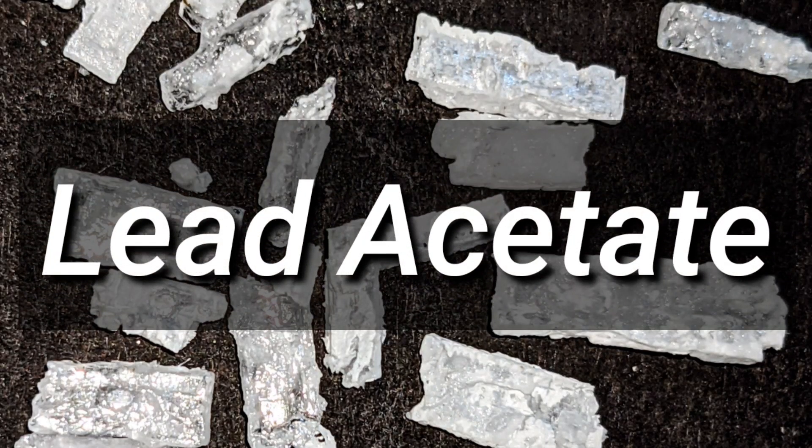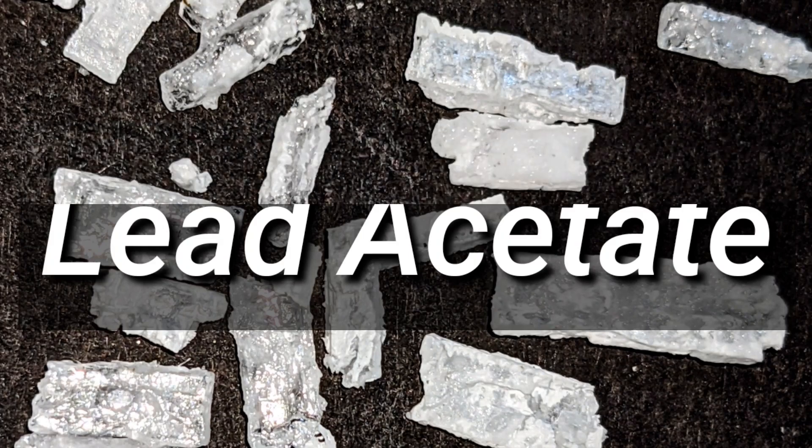Hello friends, in this video we make lead acetate via the reaction of lead metal with glacial acetic acid.